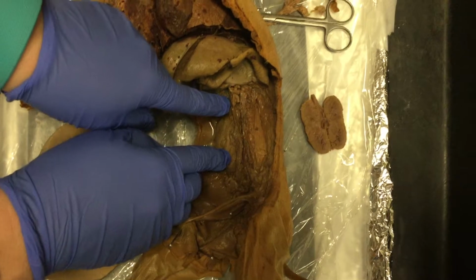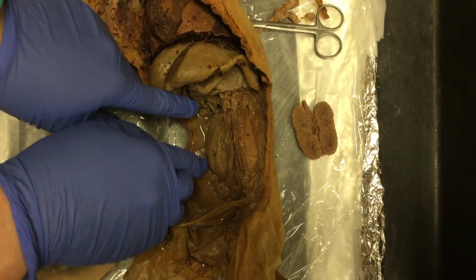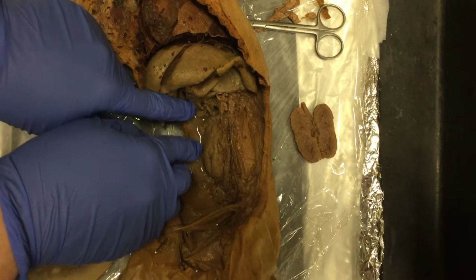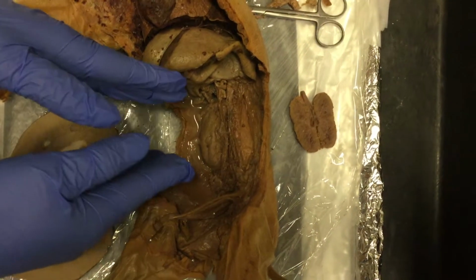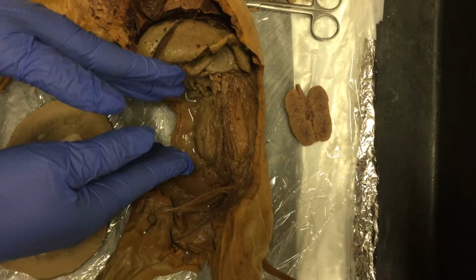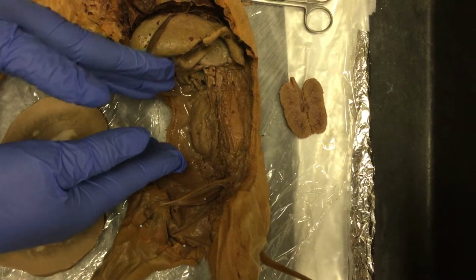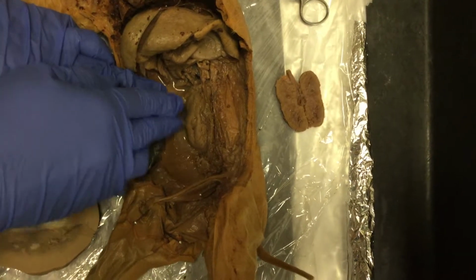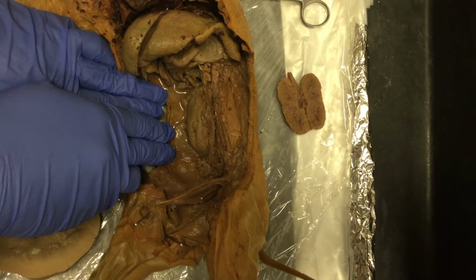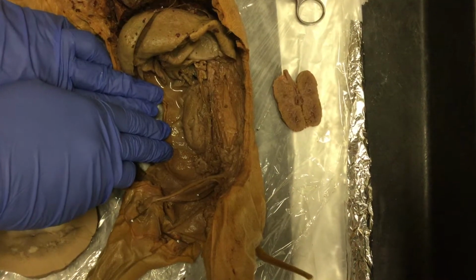We had to cut through the peritoneal membrane that was around the kidneys, and the peritoneal membrane is used to help protect the kidneys. Also, kidneys have fatty tissue around them to also help protect the kidneys, which we had removed prior to observing this structure we see right here.